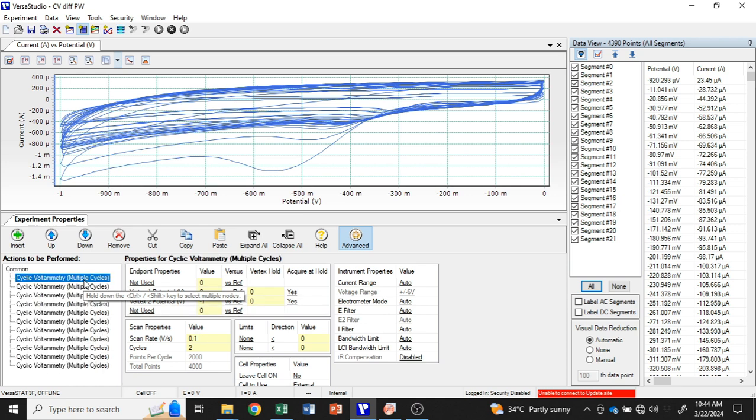Because I'm going to do a device fabrication, I'm going to show you how it is done in research papers, to plot side by side the negative electrode and also the positive electrode, because in an asymmetric device we are combining negative and positive.